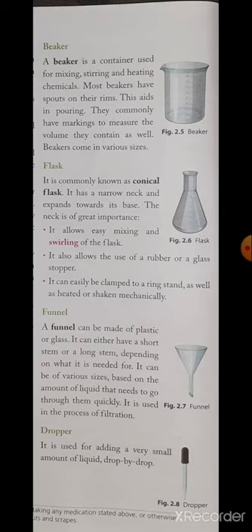Now we will discuss the flask. Flask you can see it is commonly known as conical flask. You can see in the figure that it has a narrow neck and it expands towards its base. The neck is of great importance because it allows easy mixing and swirling of the flask. Swirling you know very well, that is, it is used for making either twisting or making different spiral pattern. It is of great importance because it allows the use of a rubber or a glass stopper. We can use just in the mouth of the neck.